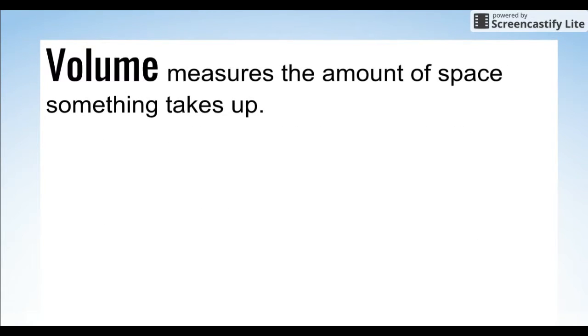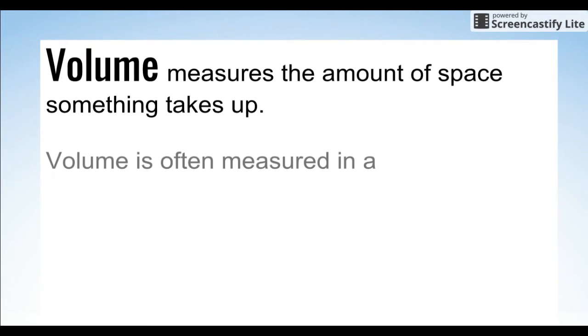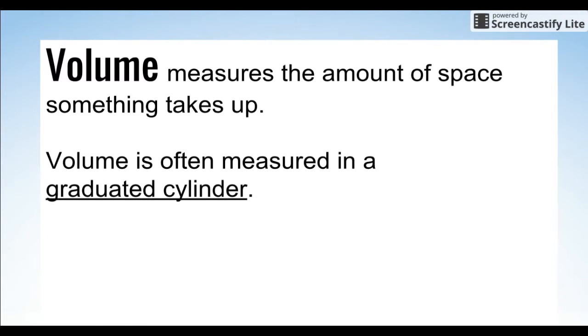Let's move on to our second unit, which is volume. Volume measures the amount of space that something takes up. Volume in the science lab is often measured using a graduated cylinder.